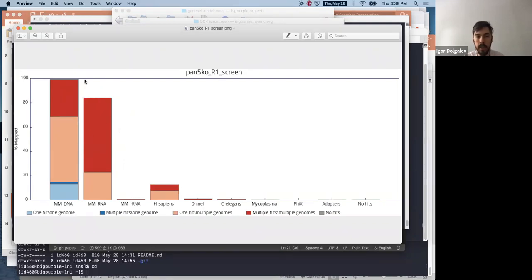And then there's also the RNA subset, which is basically the transcriptome. So most reads are aligning to the transcriptome. There are a few reads that are aligned to the genome, but not to the transcriptome, because although you would like to think that annotation is perfect, there are actually some genes that may be unannotated. And so that could be coming from there. You could have maybe a little bit of DNA contamination.